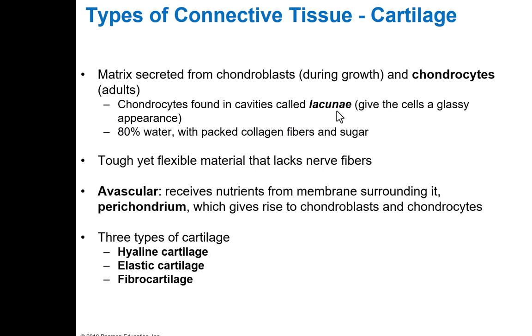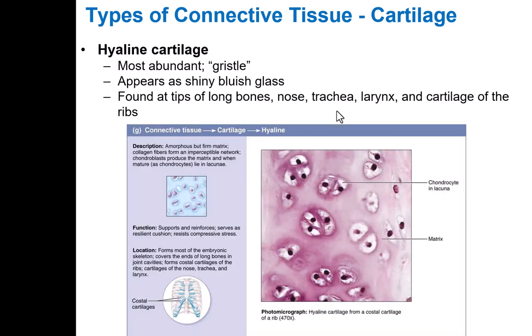So let's show you an example. So this is hyaline cartilage. One, you see these really dark dots?